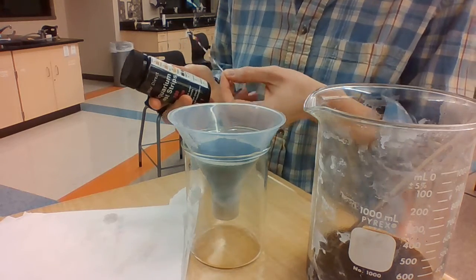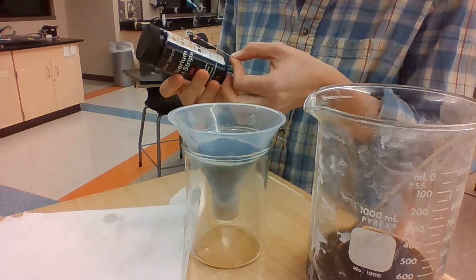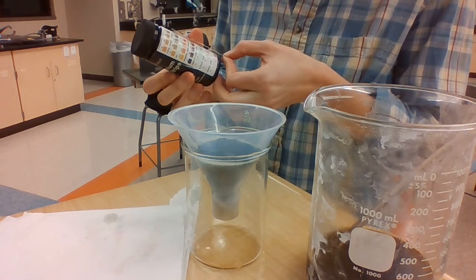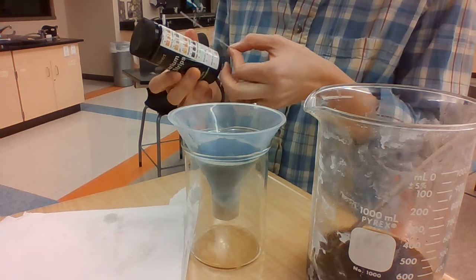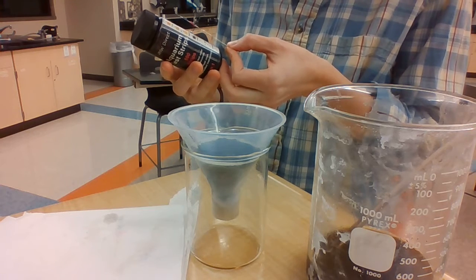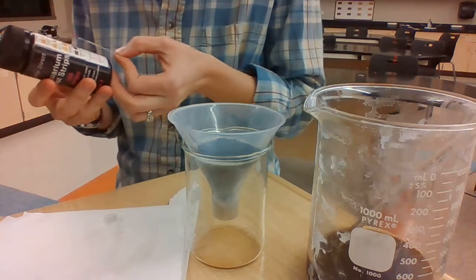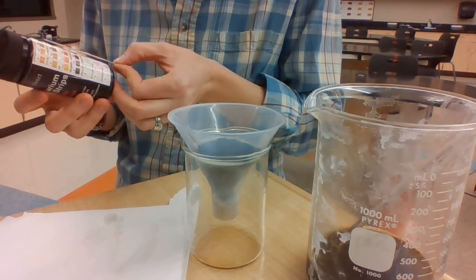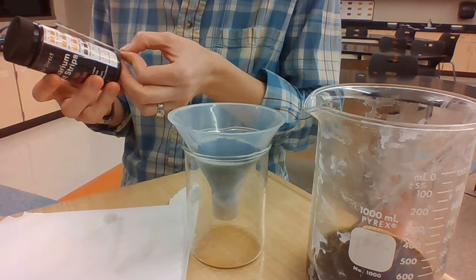Our first test is nitrate, and the value of the nitrate is 100. Record that, 100 milligrams per liter. Nitrite is the second test, and the nitrite color code ends up being 10.